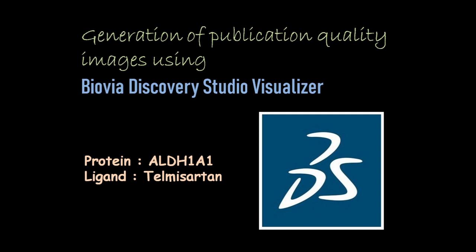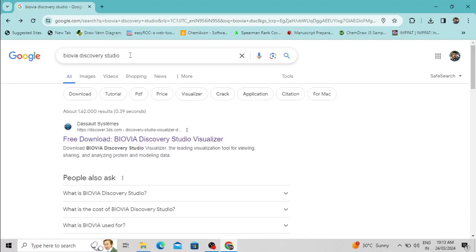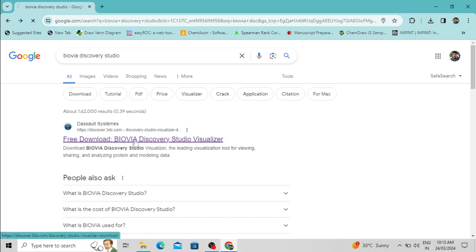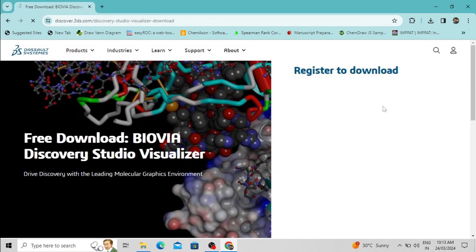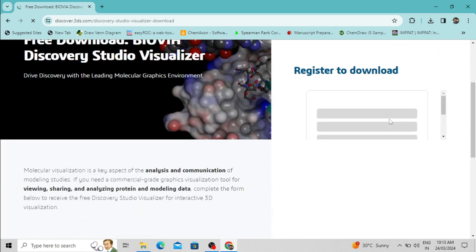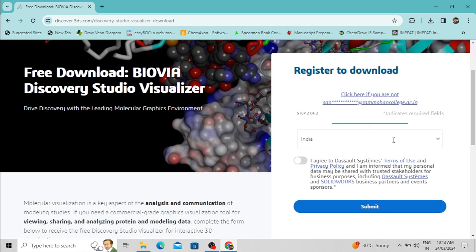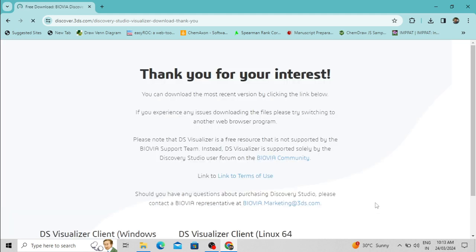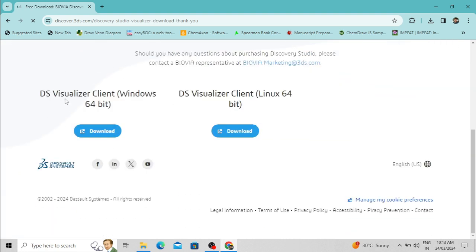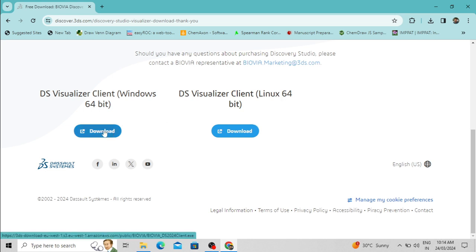In this video I am going to use BIOVIA Discovery Studio, and first of all I am going to download it from the website. To download the software, type in Google 'BIOVIA Discovery Studio' and open the download link. You have to register — an email ID is required for registration. Select your country, accept the terms and conditions, and then submit. The download link will open, showing options for Windows and for Linux.